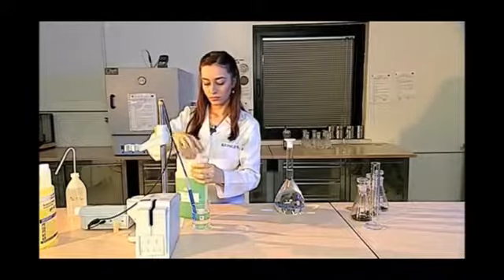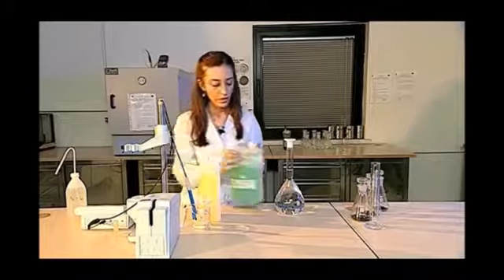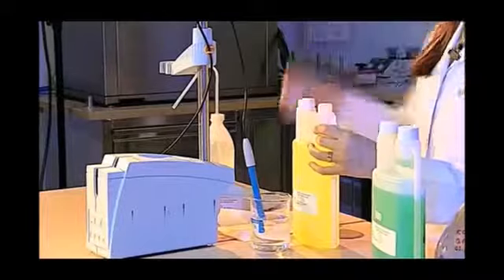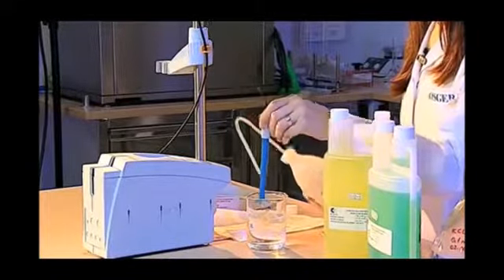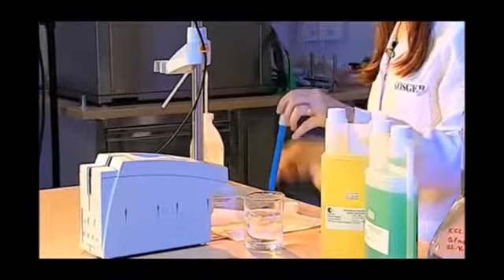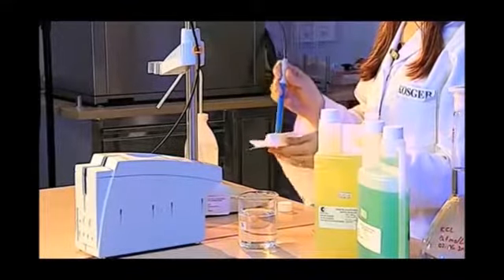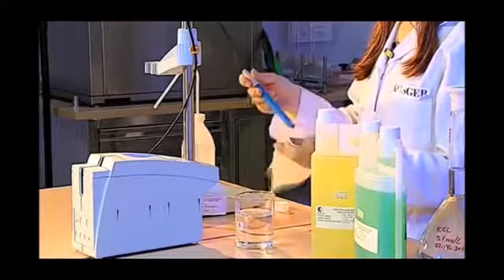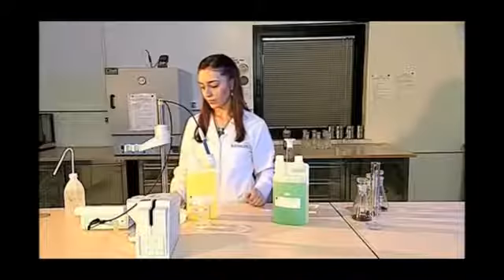Then I get the pH 4. The priority should always be given to the pH 7 in the calibration process, for this process provides neutralization of the pH meter. If our work range is with alkaline samples, then we use pH 7 and pH 10. After drying it well, this time I dip it into the pH 4.